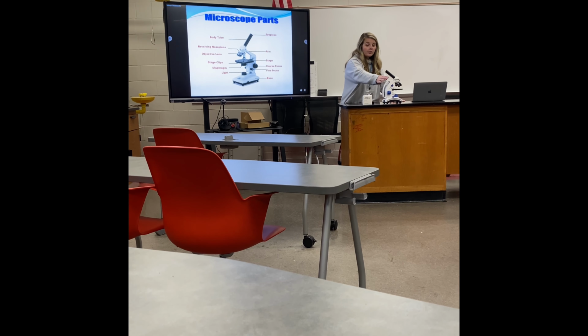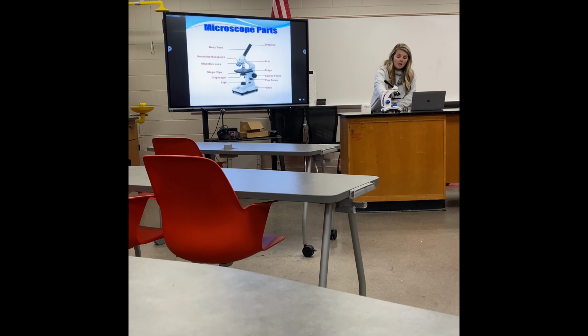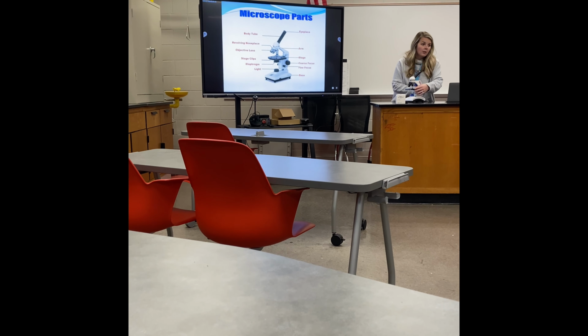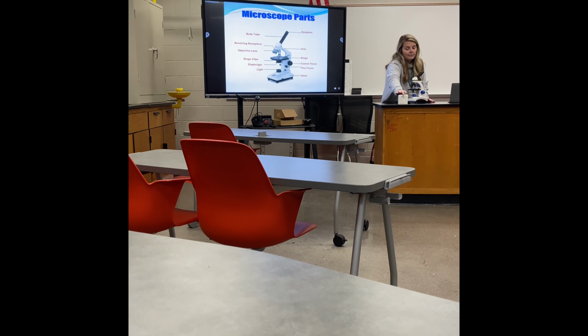As I mentioned earlier, this is the arm. These clips right here on the side are called stage clips, and they're used to hold the slide in place.